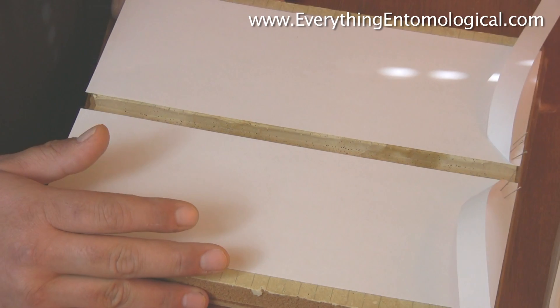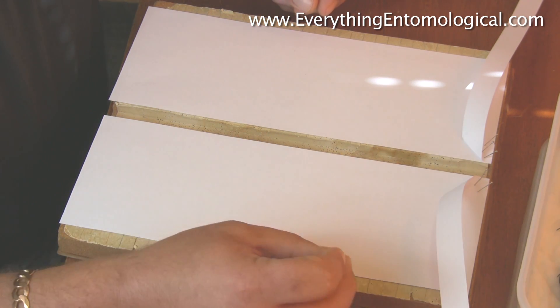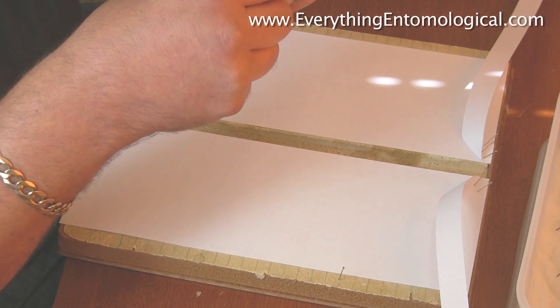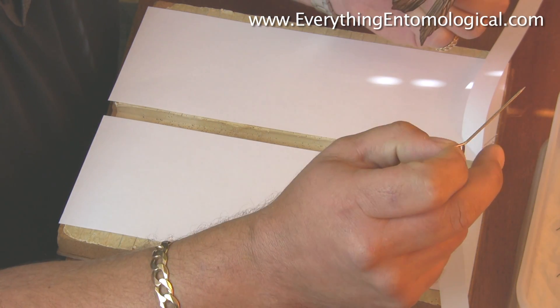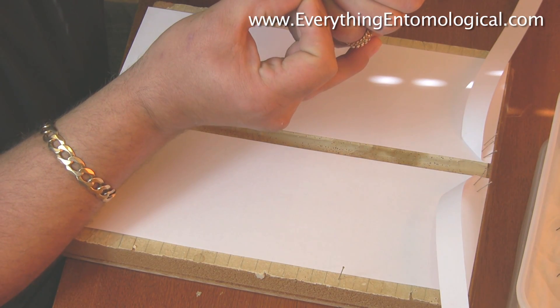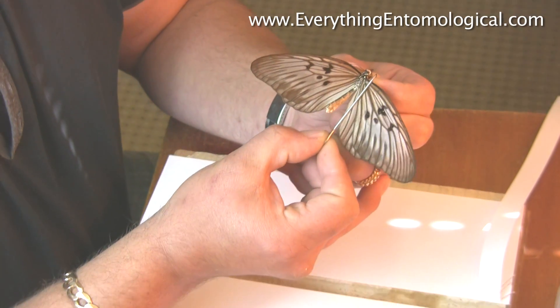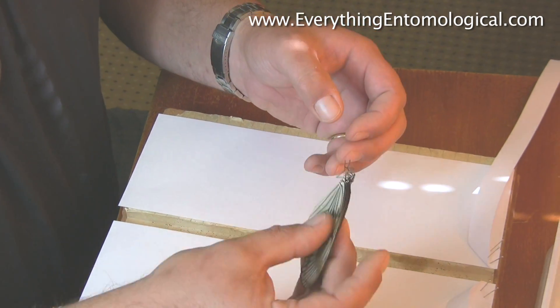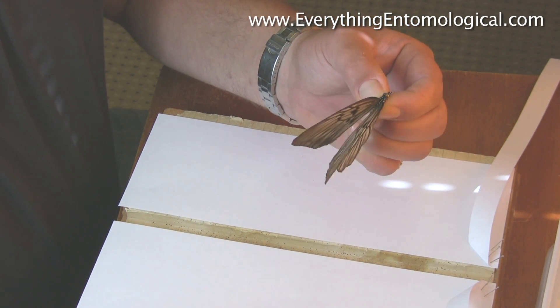You'll need entomological pins in various sizes — this is quite a small one. So you get your specimen; this is what you call Idia blanchari from Indonesia. You relax it on some tissue paper with water — you don't really need to use relaxing fluid, it does the same thing. You put them in to relax for a couple of days until they're pliable to move. Try not to smudge the wings when you hold it — hold it very gently and grab its thorax.